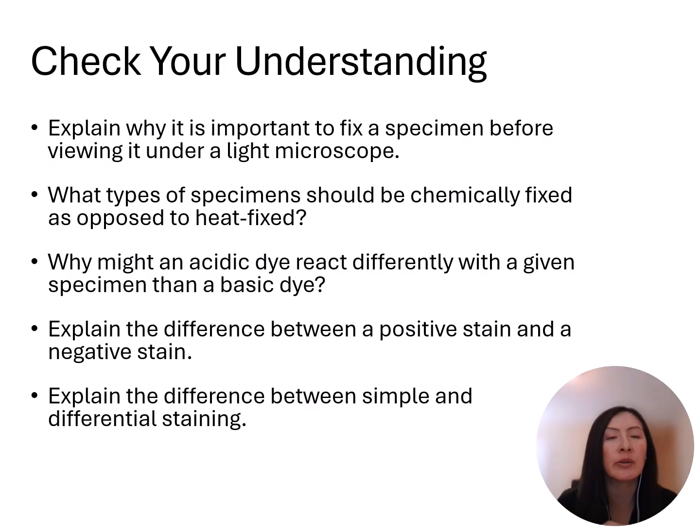I kind of mentioned that earlier. Positive stain, the dye will bind to and color the specimen, whereas the background is not stained. Whereas in a negative stain, the dye is repelled by the cell or the specimen and stains the background.